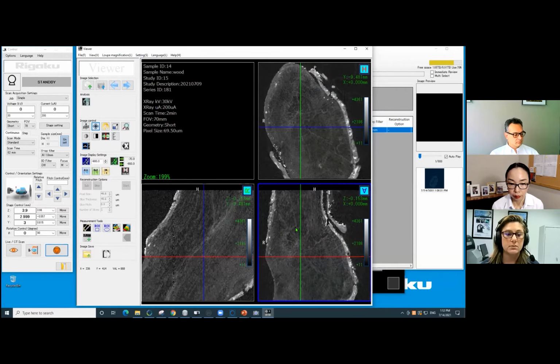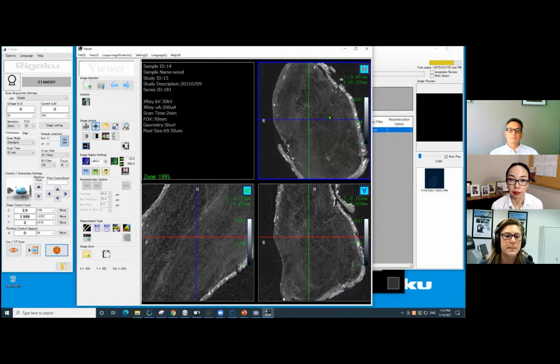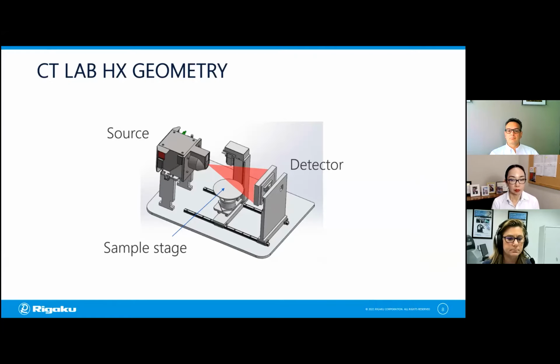So it doesn't look necessarily bad, right? And we are using a low energy, so we would expect that. So it turns out that ideally, this is not the best condition to measure. And to illustrate that, I'm just going to go back to our PowerPoint for a moment so that we can do a quick comparison of those.